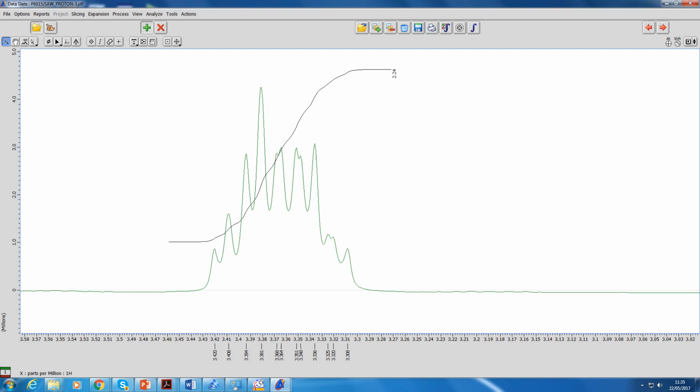So this is just move with the hand, just moving with the left mouse button. You can move X and Y with Alt. It only moves whichever one's selected up here, so the second one relative to the first one, and with Shift it's only moving in Y. Have a play. I think you soon get to grips with it.